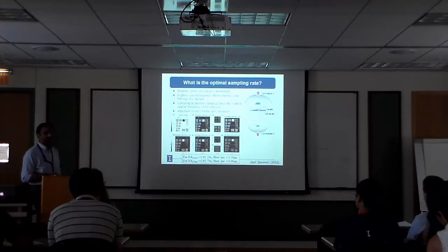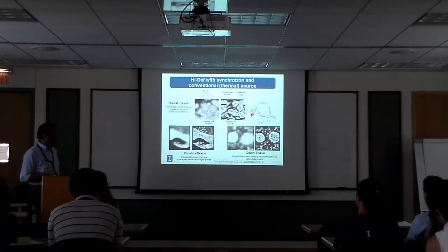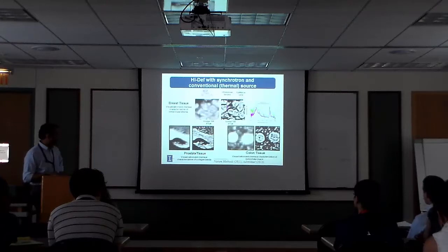It's really higher NA and better pixel spacing. That's really what it is in that sense. So the way this has really changed the field is this. This is commercial, best state of the art. This is what we get. This was the first study we did. This is actually on a synchrotron, because now you have a much smaller pixel, so you need higher light throughput.